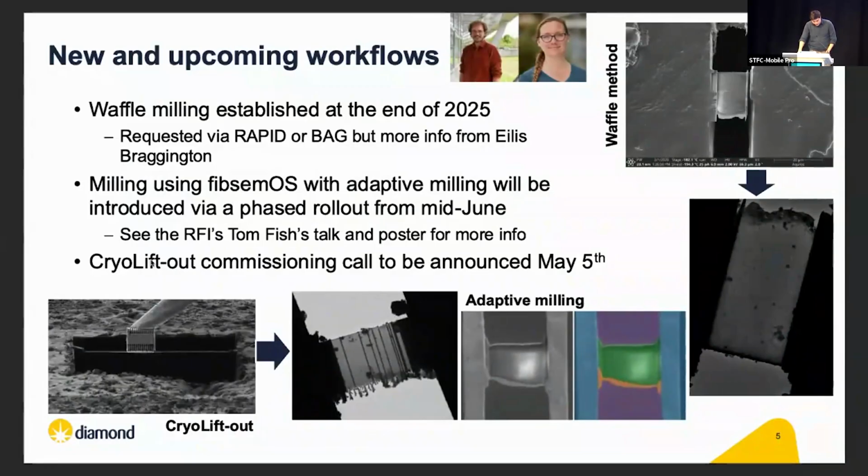Then sticking with the milling side, there's going to be a phased rollout of some of the adaptive milling workflows being developed at Rosalind Franklin Institute across the road. So Tom Fish has a talk later today, I think, and a poster about that. And then in May, there's going to be the announcement of a commissioning call for cryo lift out workflows.